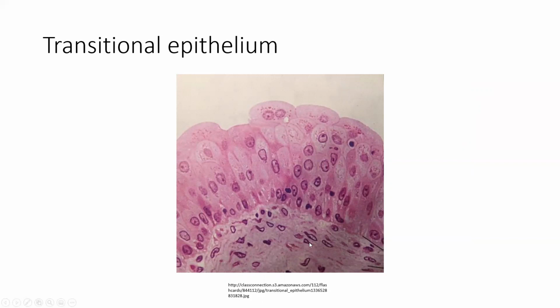What I recommend my students do is, again, look at the nuclei of the cells. In pseudostratified columnar epithelium, not only do you see clear columnar shaped cells, which is different from what you see here. Got a bit of a mix of everything. A little bit of columnar right here and right here, but also somewhat cuboid over here, here, and here. You can look at those features. You can also look at the nuclei, which tends to be a lot more reliable of a factor.